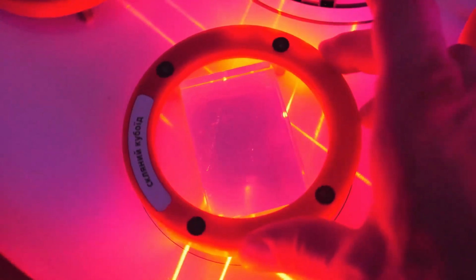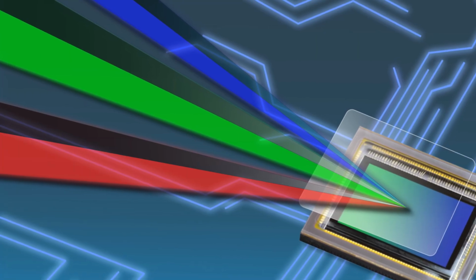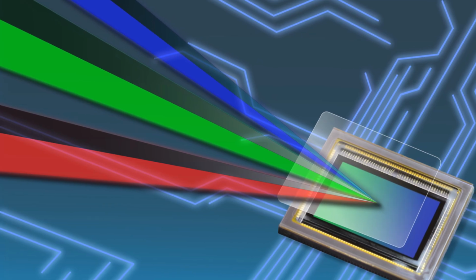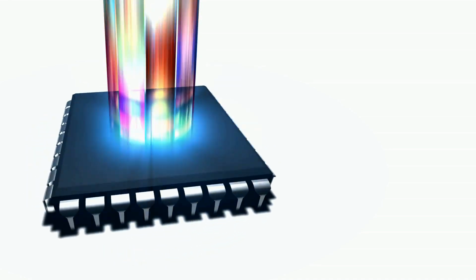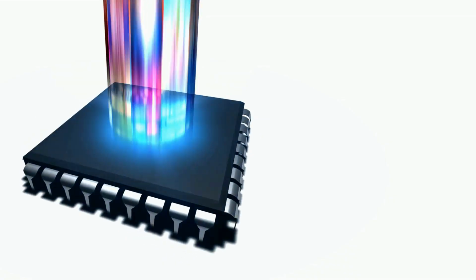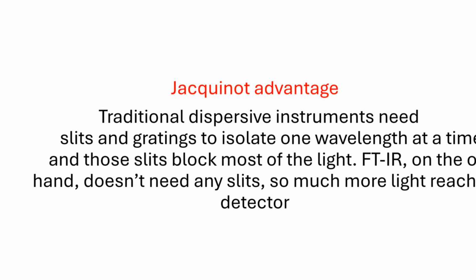Both devices split wavelengths in space. We physically point the detector to a different angle or slit to read each wavelength. FTIR avoids all of that. Instead of physically spreading the colors apart, it lets all the wavelengths hit the detector at once, but in an encoded form. A computer performs a Fourier transform to mathematically extract each wavelength from the interferogram, much like recognizing individual musical notes inside a chord. Once you understand that, the advantages of FTIR make complete sense.